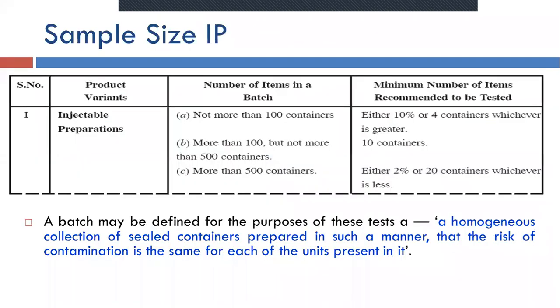And this is as per the Indian Pharmacopoeia. For injectable preparations, once again the same thing: not more than 100 containers, either 10% or 4 containers, whichever is greater, we have to take. So almost similar to the USP.